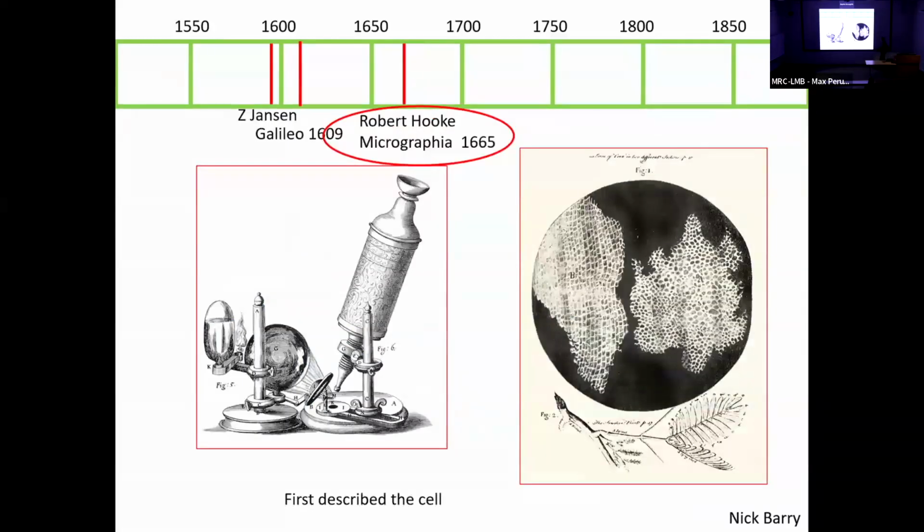But really, the landmarks were Hooke. He had a simple lens just down there, and he looked into a world. It's really remarkable that a small bit of glass with a spherical surface gave us a window on a world that up until then had never been seen by mankind. All the small stuff we were not aware of prior to this sort of work. And so Hooke, for example, coined the word cell when he looked at a piece of bark from a cork, I think that's from.